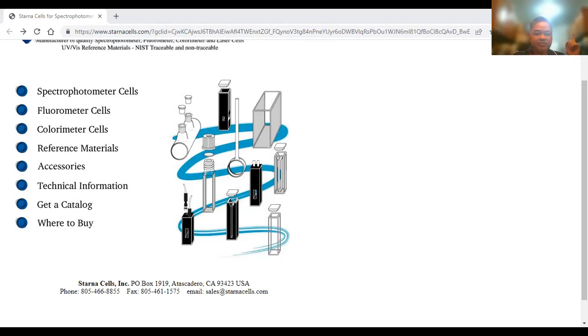Especially if you're monitoring in real time what's happened during the reaction. So they have that. The other one that we have is the detectors. Our eyes are, we could say, a detector that we have. The area detector could be the eye or the film. Now, detectors usually use devices that convert light into an electrical signal.